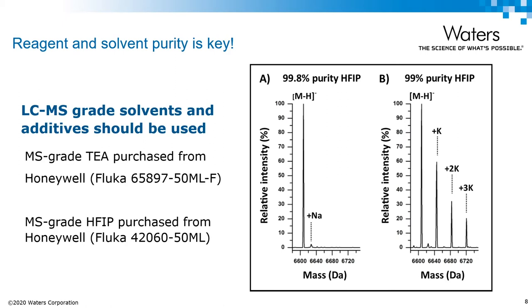Because of the negatively charged phosphate backbone, MS is typically run in negative mode, which results in the presence of sodium and potassium adducts. If you're familiar with oligo MS, you know that this is a really big problem. Here we have 99.8% pure HFIP on the left and 99% pure HFIP on the right, and although different vendors assay their reagents differently, it's clear that the lower purity additive is much more susceptible to adduct formation.